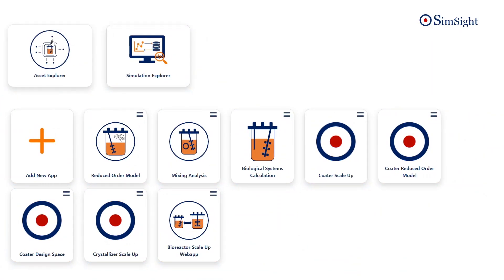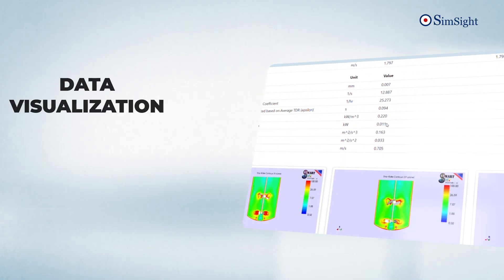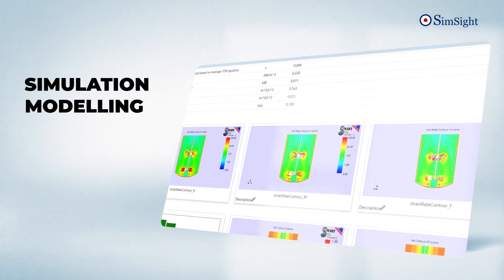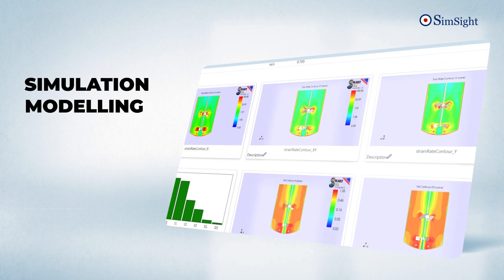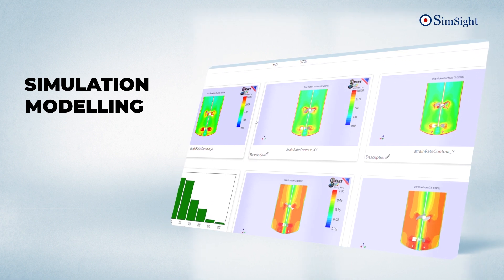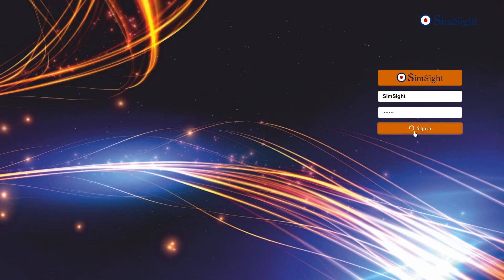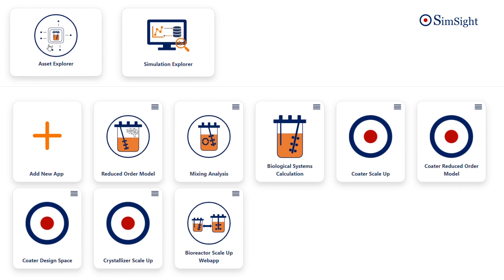SimSight's intuitive user interface and range of tools make data visualization, statistical analysis, and simulation modeling seamless and extremely easy to use. Its unique and highly customizable dashboard view lets you track KPIs and make data-driven decisions with confidence.